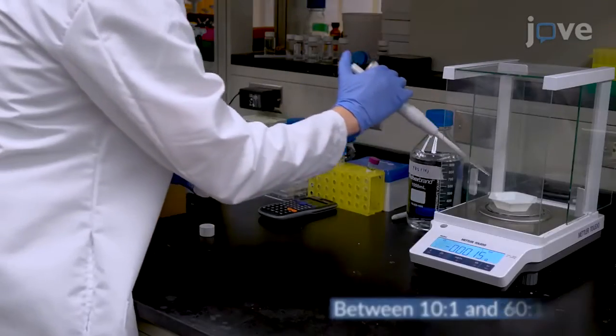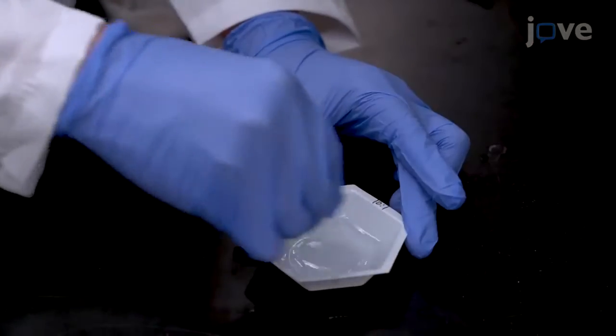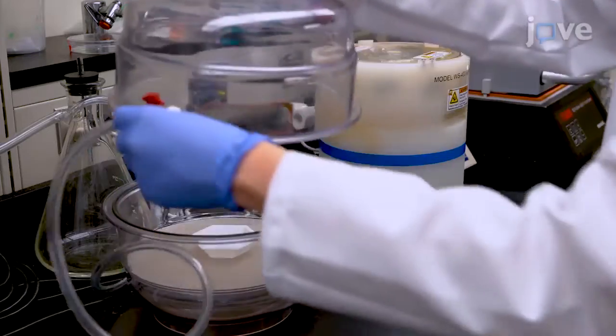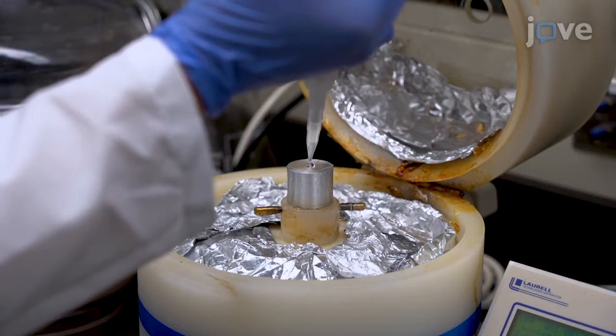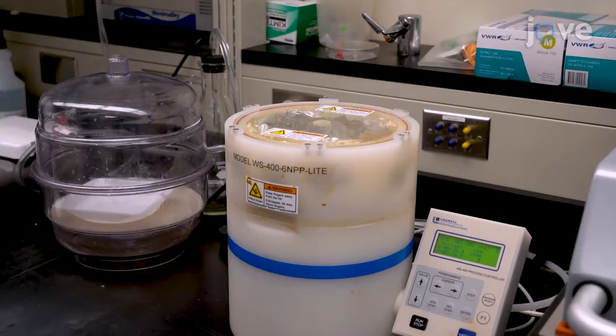Begin by vigorously mixing the PDMS-based elastomer and curing agents with a pipette tip until bubbles are homogeneously dispersed within the mixture. Then, remove the bubbles with vacuum desiccation. Place a drop of the desiccated PDMS mixture on a square or circular cover slip, and rotate the cover slip on a spin coater at 2500 RPM for 30 seconds.